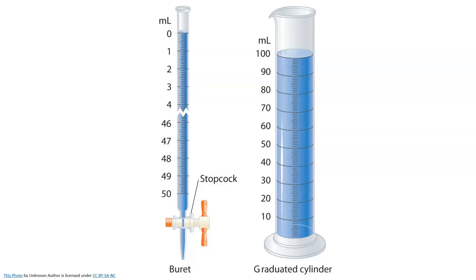Your stopcock controls the liquid flow when it's open, when it's parallel. So if you look at this picture, this stopcock is open, so as you would know, it's going to be dripping when it's open. Okay, let me just show you. This is just like the one you're going to actually see during class.